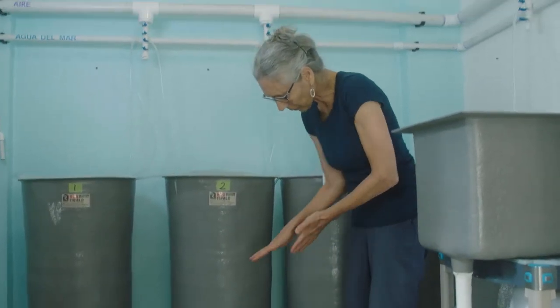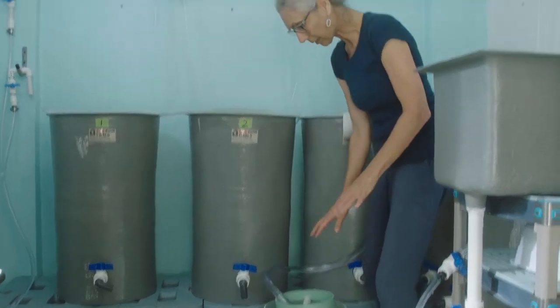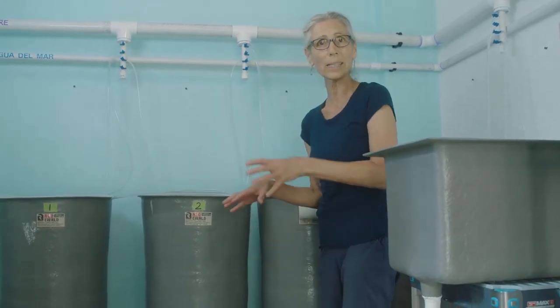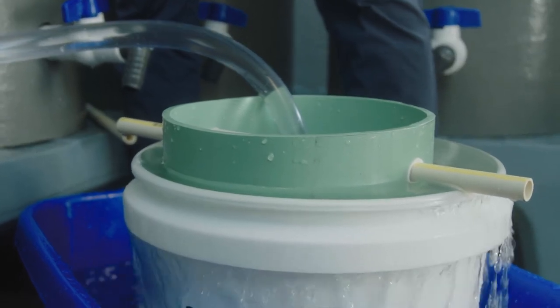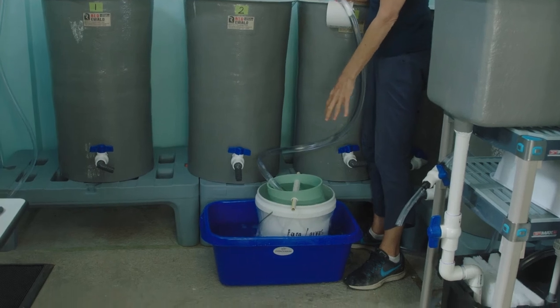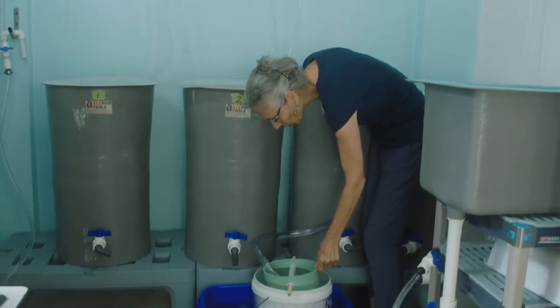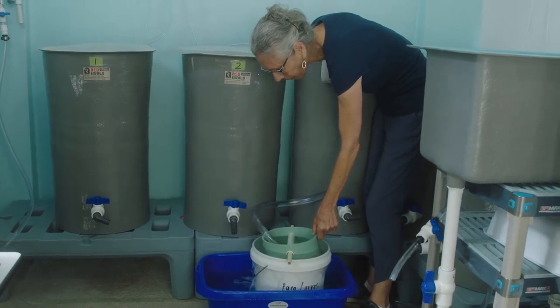A couple of things to keep in mind during larval changes: make sure the sieve is not tipped so you don't lose any veligers, and keep it secure. We stay right here watching exactly what's going on — we don't leave the room or get distracted. We use this blue bin to keep water off the ground, much better to keep a dry area especially in a small hatchery. We keep aeration going in the tank because it keeps all the veligers in suspension. It's nice to shake the sieve gently once in a while without upsetting the siphon.